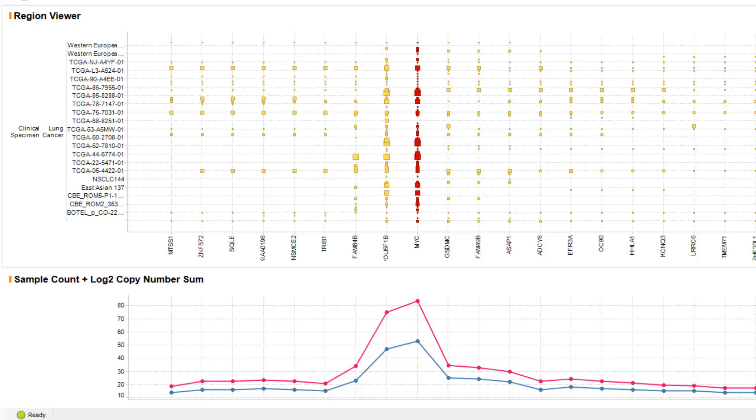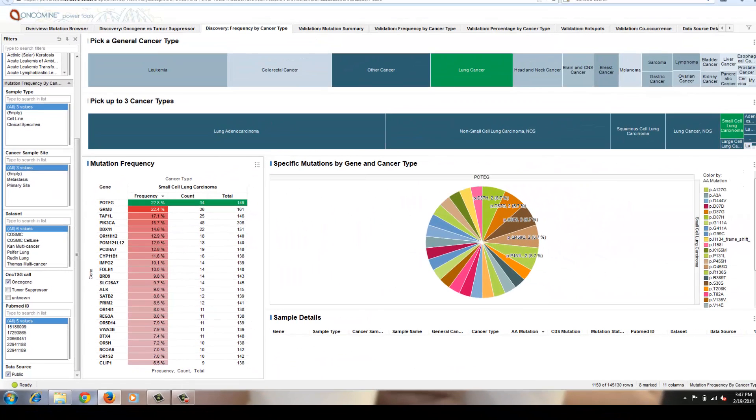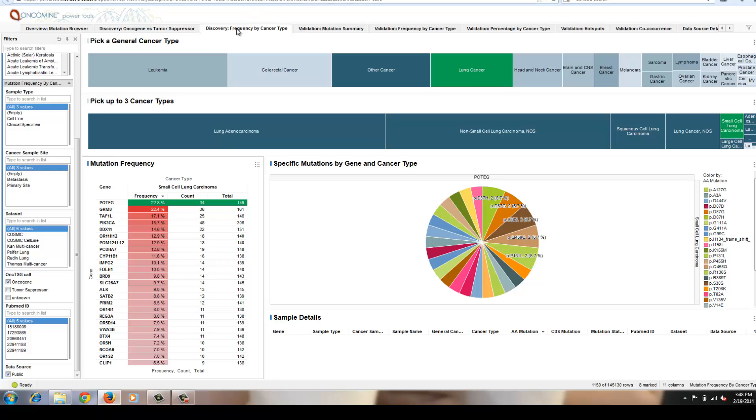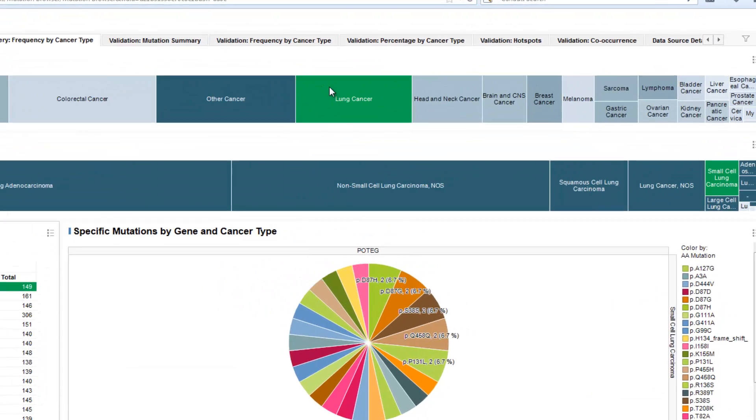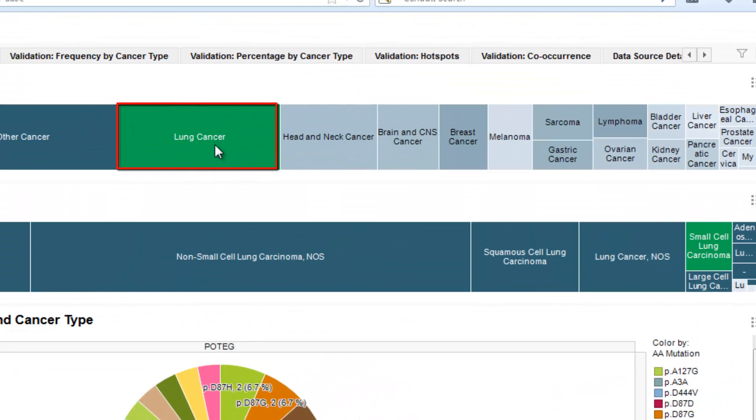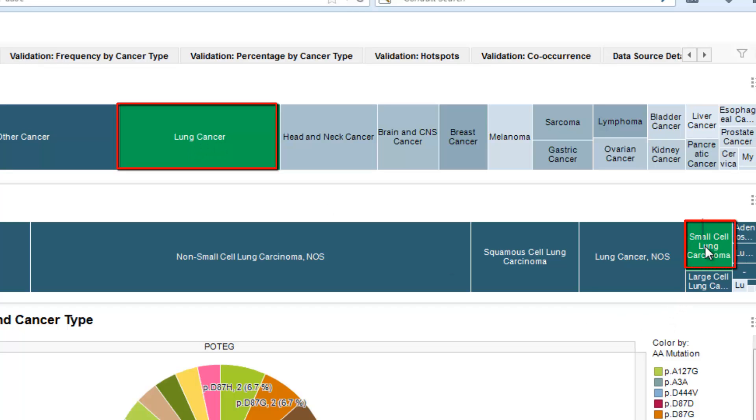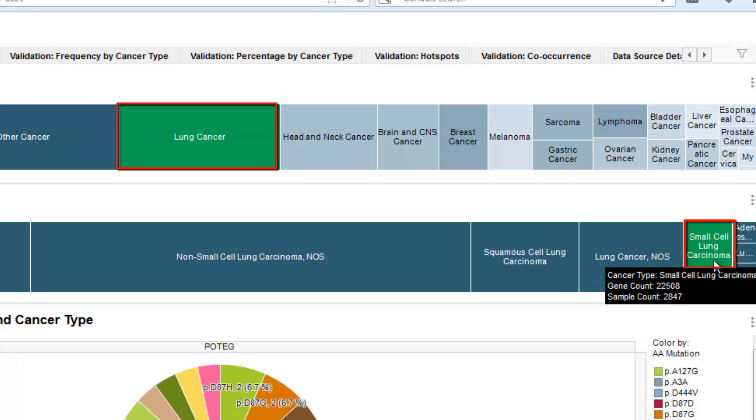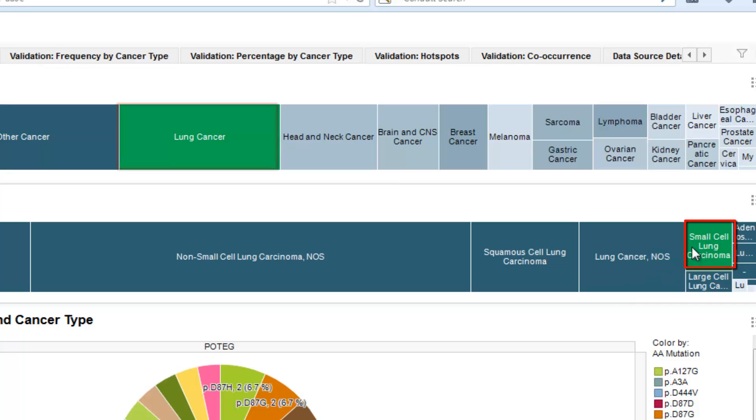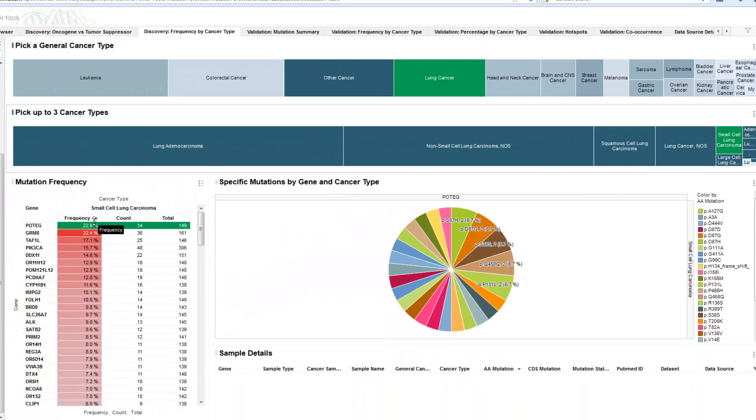Another application in the Oncomine Power Tools suite investigates mutation data. This data is collected from the public domain. It includes targeted assays, next-gen sequencing assays, as well as data from the COSMIC repository. In this view, we're looking at a discovery workflow. There are also validation workflows. You can investigate a single gene for its frequency across cancer types. Here, we've selected in this top tree map view the general cancer type lung cancer. In the specific cancer type, we've selected small cell lung carcinoma. When we do that, we're summarizing across all of the small cell lung carcinoma samples, the mutations that have been identified, and summarizing the frequencies.